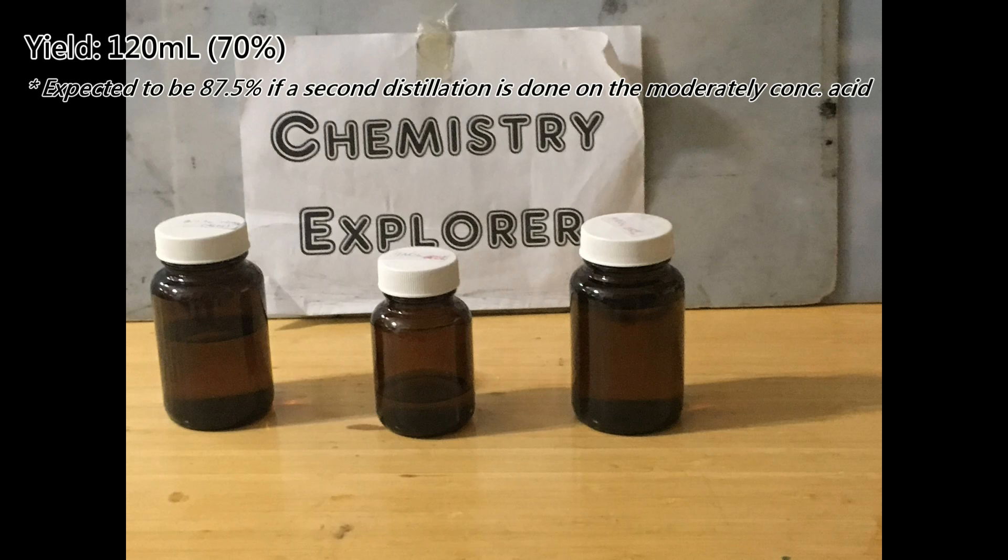Excluding the 70ml of moderately concentrated nitric acid, the yield was 120ml, which represents a yield of about 70%, which is not too bad. I believe that if I do a second distillation on the moderately concentrated acid, I can raise the yield to about 150ml, which is about 87.5%.